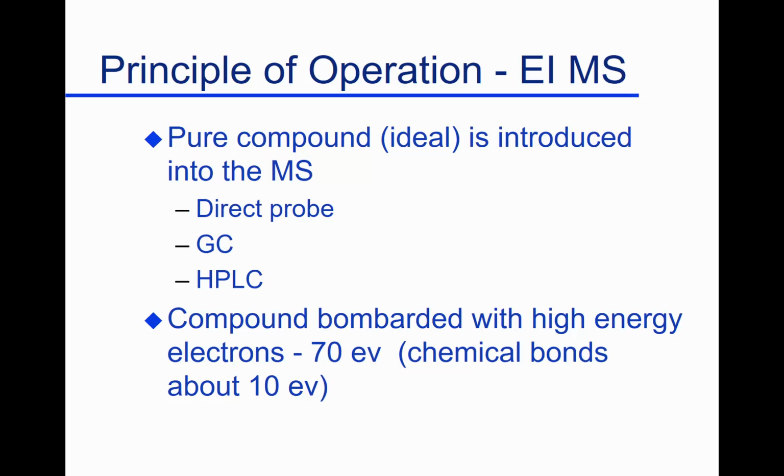It absorbs energy and it just literally explodes. There'll be some weak bonds that readily break, and some strong bonds that are not going to break apart. So every molecule has some weak spots and some strong spots. And so that molecule, when hit with that energy, will always break into the same pieces, the same fragments. We're going to measure those fragments, then go back to libraries and ask what molecules have those fragments.